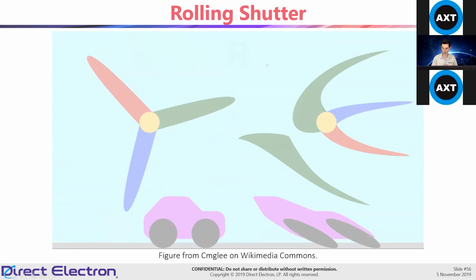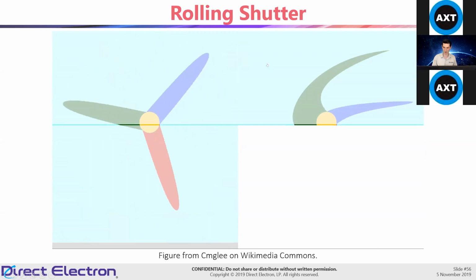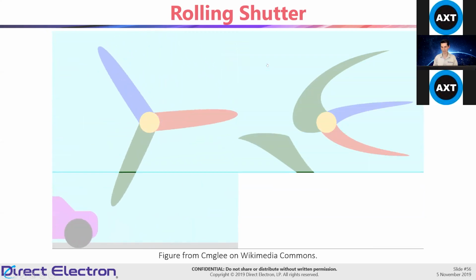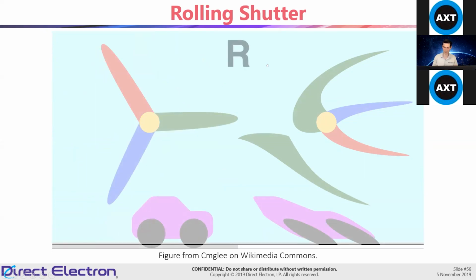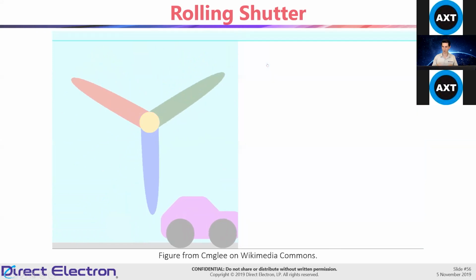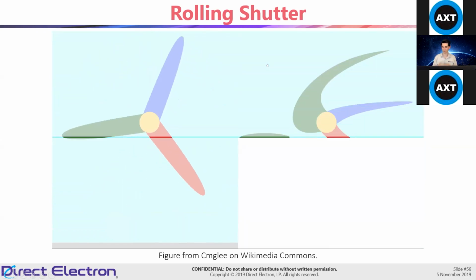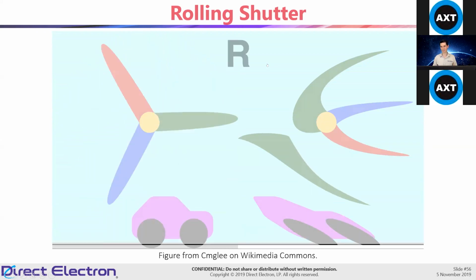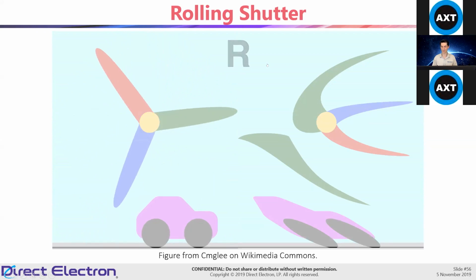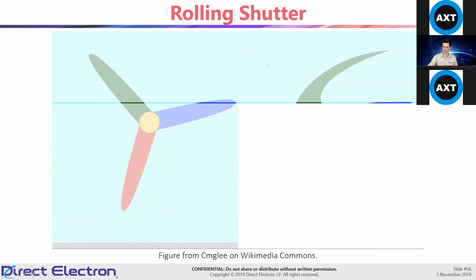When you're doing these kinds of experiments, if you don't have the global shutter, then your data is lesser quality, and people want the best quality data, right? So for some types of experiments, especially micro-ED, diffraction in general, the rolling shutter is not something that you want to be stuck with. A global shutter is really what you have to have.